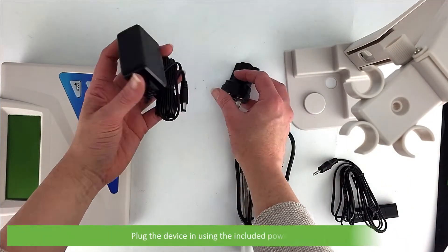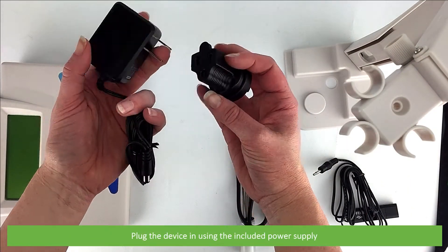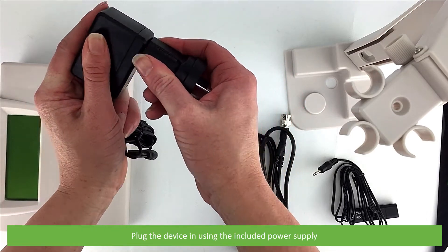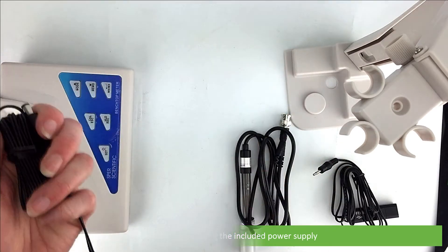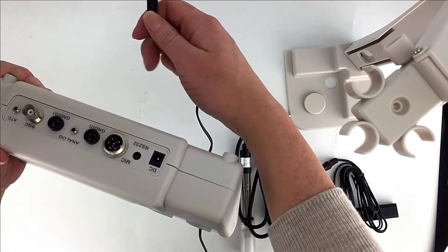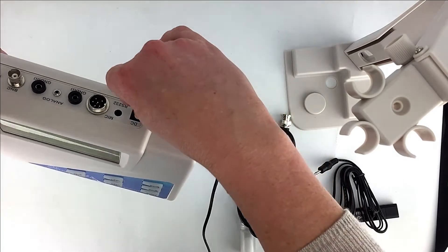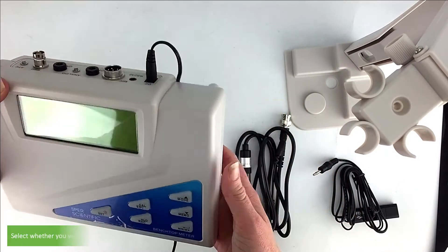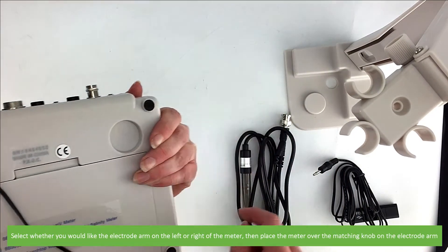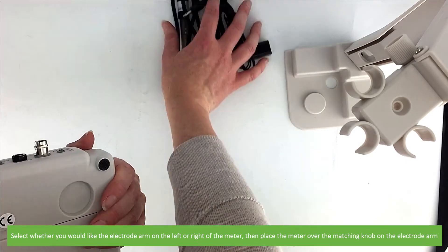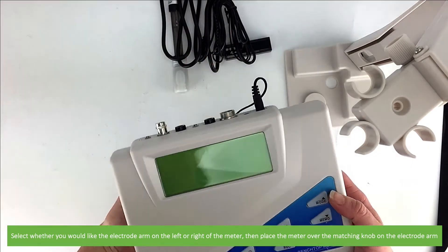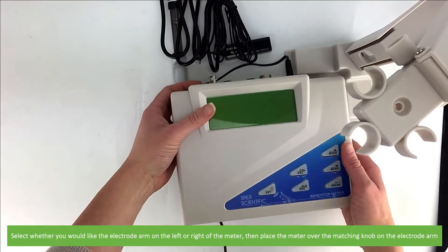Plug the device in using the included power supply, then select whether you would like the electrode arm on the left or right side of the meter and place the meter over the matching knob on the electrode arm.